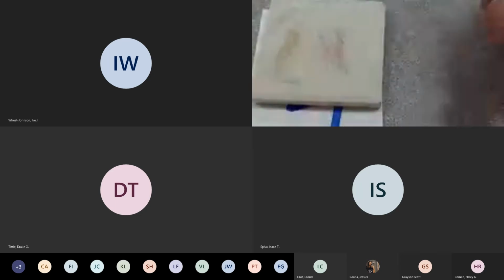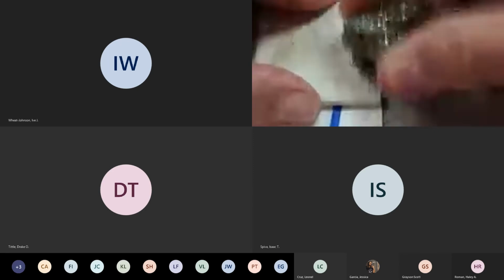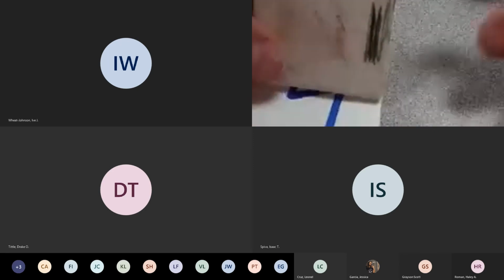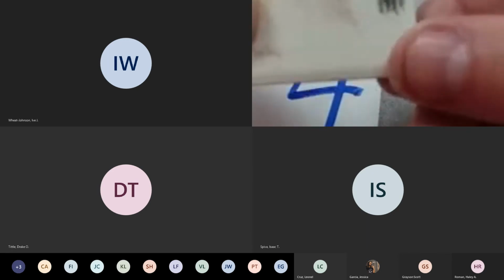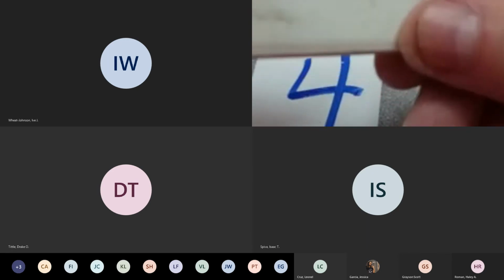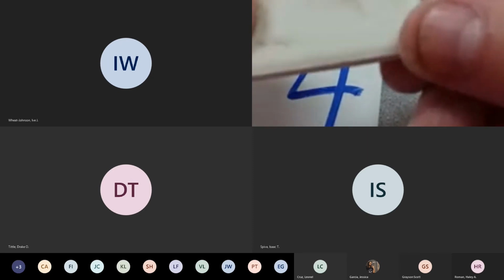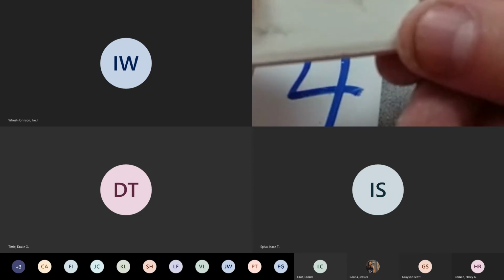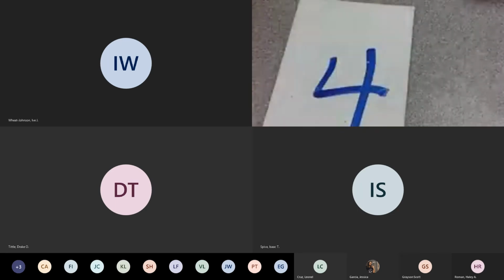Streak. Definitely left a streak. So describe the color of that streak.